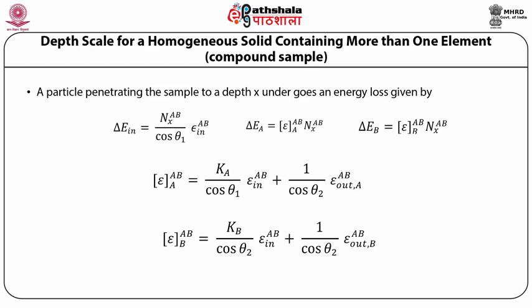For simplicity, we denote the material as a compound sample, although it could be either a mixture or a chemical compound. This case differs from that of the monoisotopic elemental sample considered thus far in two ways.